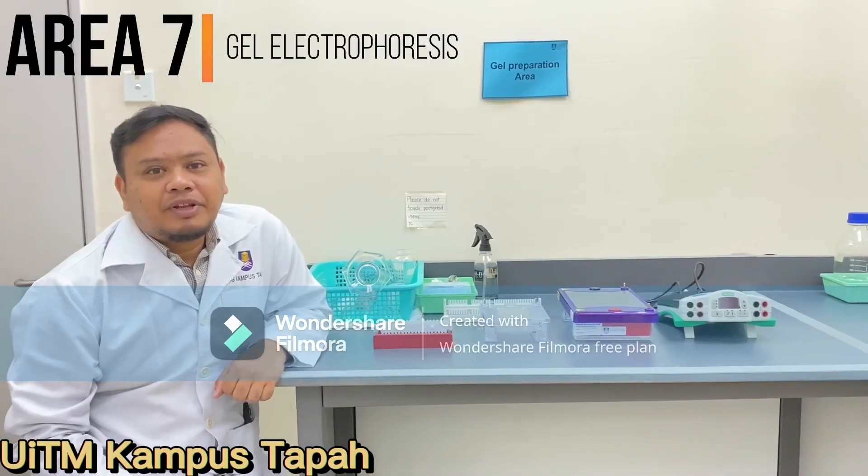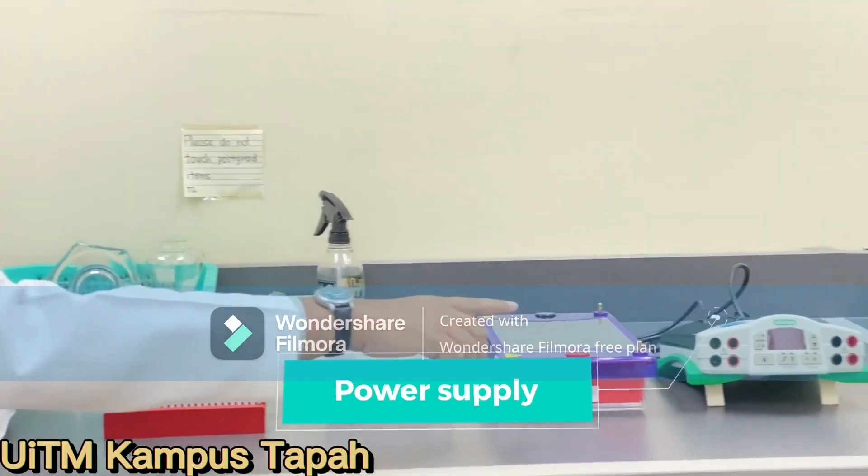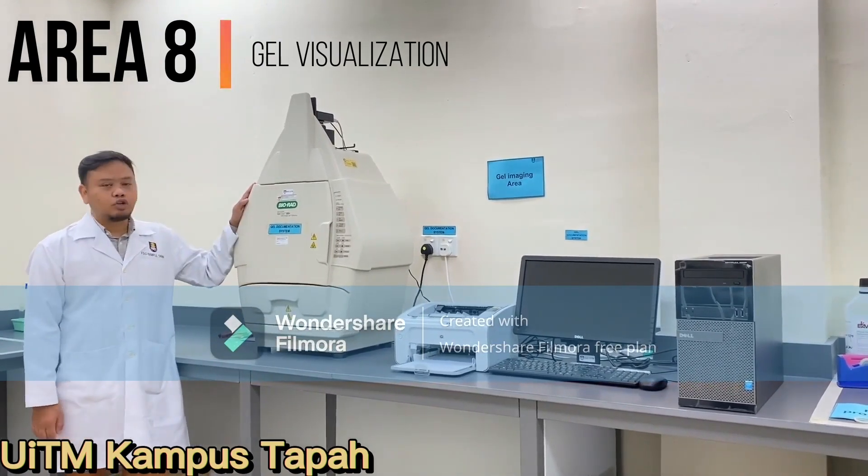This is our gel preparation area. We have here both of our gel electrophoresis chambers and also our power supply. This is our gel imaging area, and here is our gel documentation system.